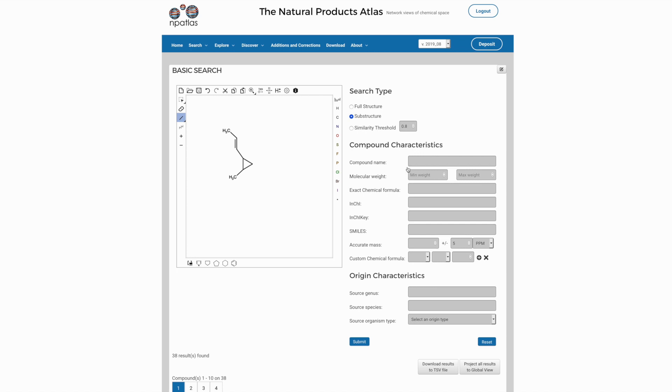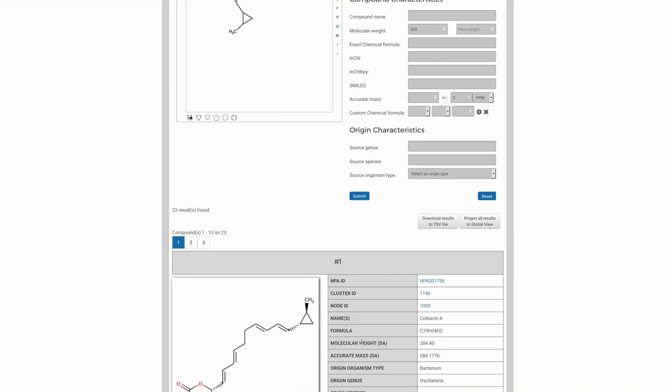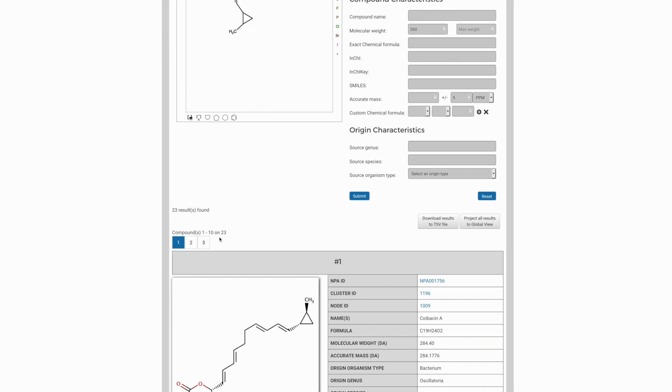So we might, for example, know from the mass spectrometry data that the molecular weight is at least 260. And if we submit this additional requirement, the number of responses reduces from 38 to 23.